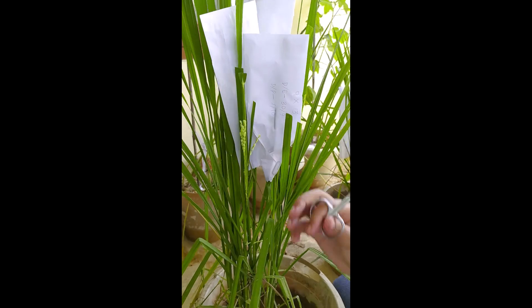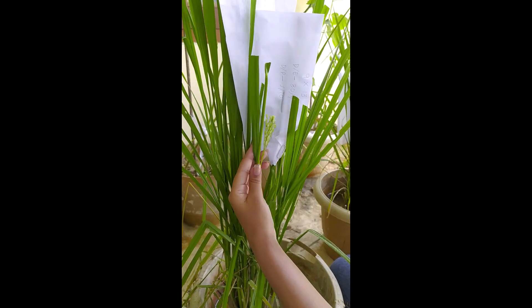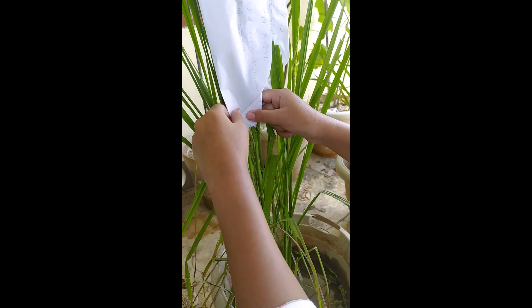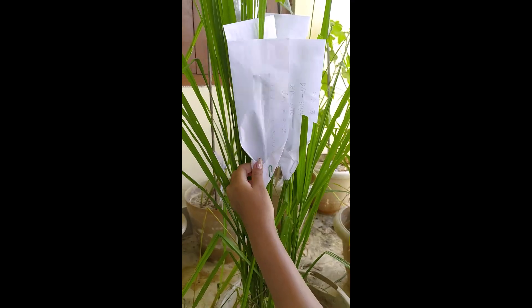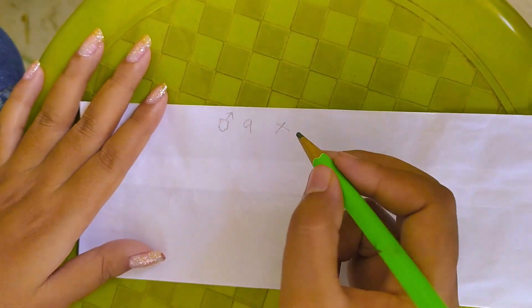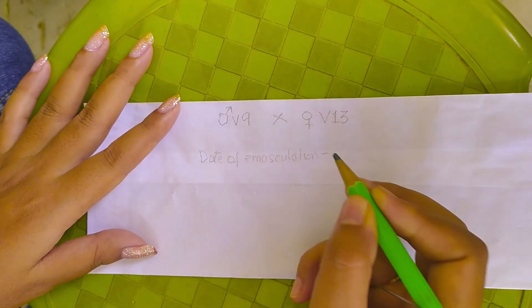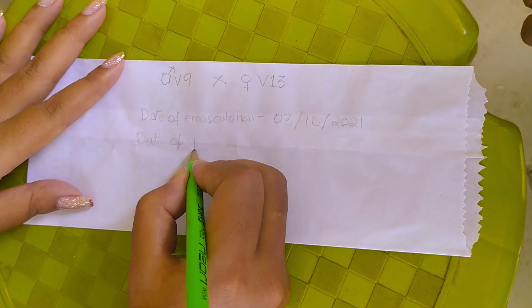After emasculation, we have to bag the panicle with a butter paper bag and clip it properly so as to prevent random cross-pollination or entry of any foreign pollen. Before we bag, we need to mention the name of the male and female parent, the date of emasculation, and date of pollination. Date of pollination should be mentioned on the day of pollination, which in general is the next day of emasculation.